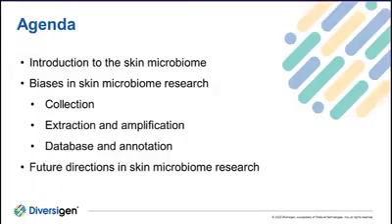For today's webinar, I'm going to be giving an introduction to the skin microbiome, talk about biases in skin microbiome research, including those related to sample collection, extraction, and amplification, as well as database selection and sequence annotation. And finally, I'm going to be talking about future directions in the field.